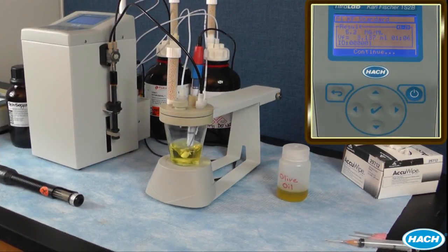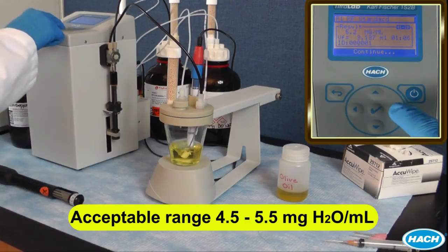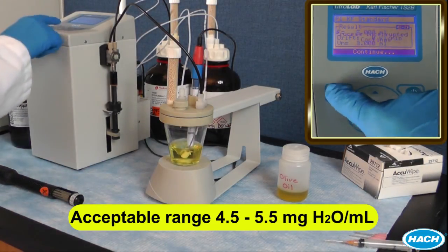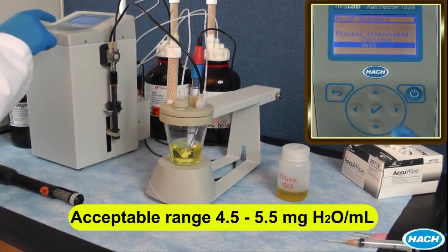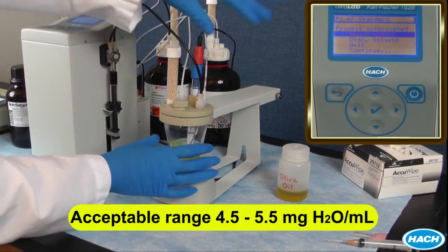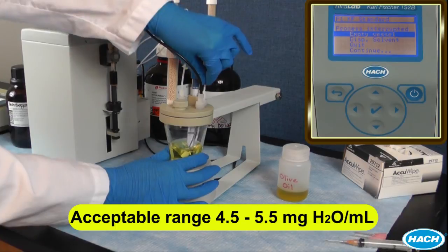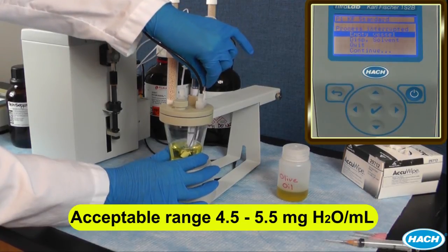Upon completing the titration, the result and titration conditions are displayed on the screen. In general, a result of ±10% of the actual value of the standard is acceptable. If your result is outside your acceptable range, you should first try re-running the verification. If you continue to get unacceptable results and you trust your standard, try re-standardizing your titrant using the standard.